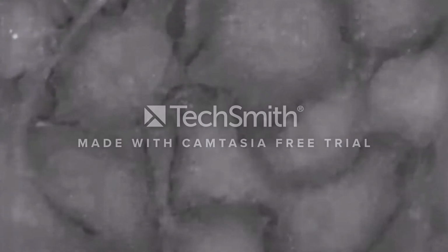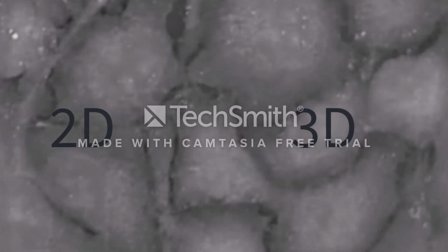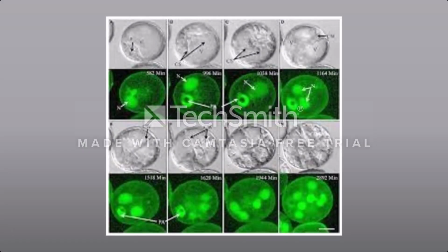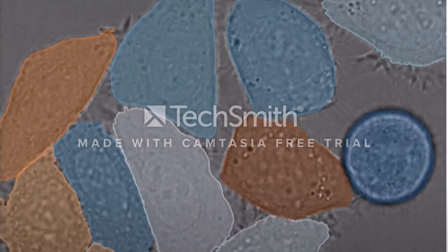Now, let us look at an overview of the dataset. As a part of this challenge, the participants are given a dataset repository which consists of 2- and 3-dimensional images. To give an example, consider images which show time-lapse sequences of nuclei. Here, one can see images captured at a specific interval and their corresponding images lit up with fluorescent color, which facilitates extra visibility. In some examples, as shown on the right side, you may also find microscopy images of cells moving on a flat substrate.